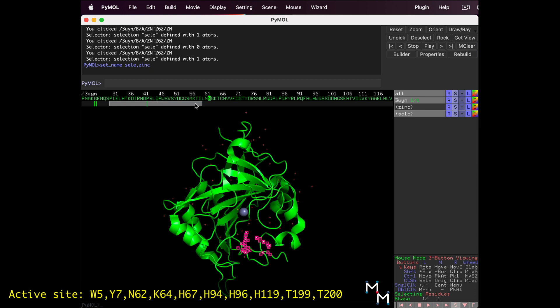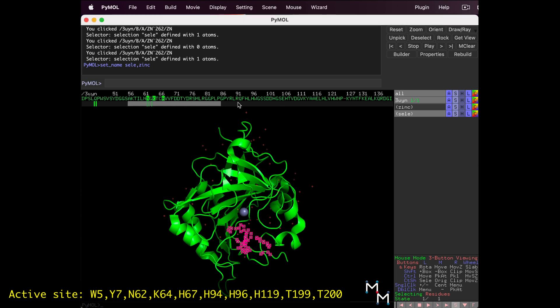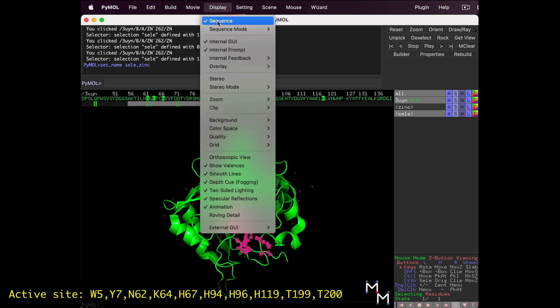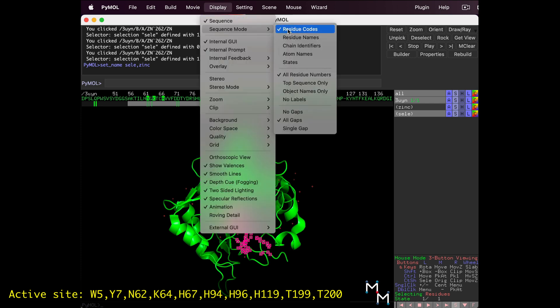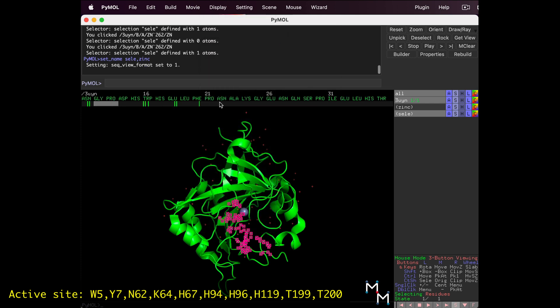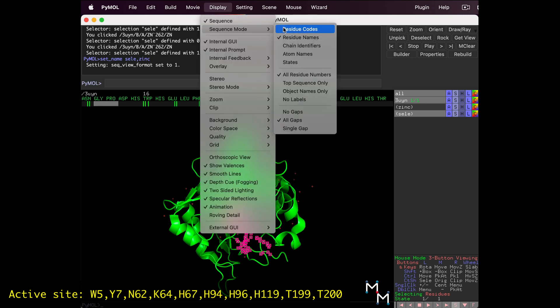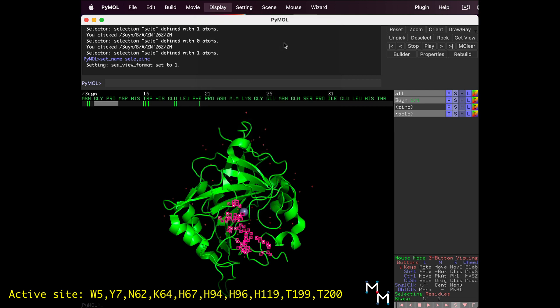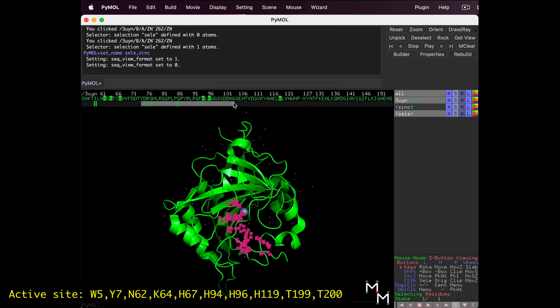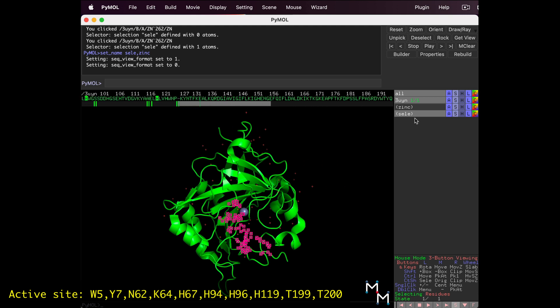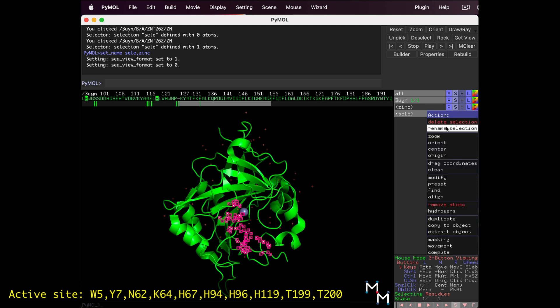K64 next, then H67. Now H94. 91, 2, 3, 4. Next up is H96. And let's stop here at Histidine 119. If it makes it easier for you, you can use the Display drop-down menu to change the sequence mode to show three-letter codes. Now, I don't, because I like the way I can see breaks in the sequence with the one-letter codes to easily identify different protein chains and ligands. Notice in the object panel, the letters S-E-L-E have popped up again. Rename this to Active.